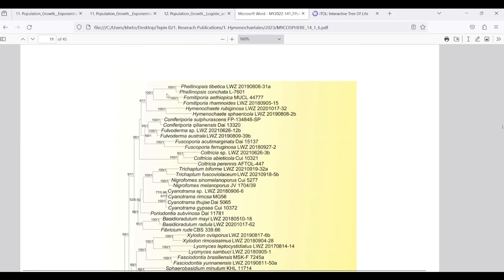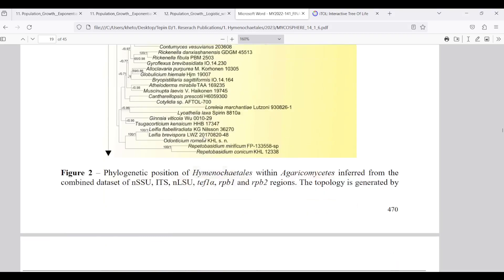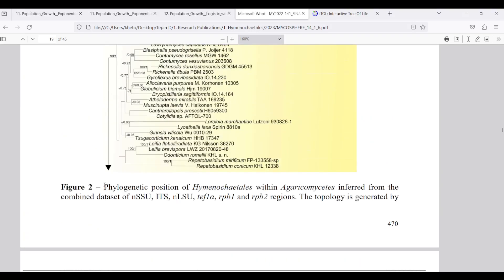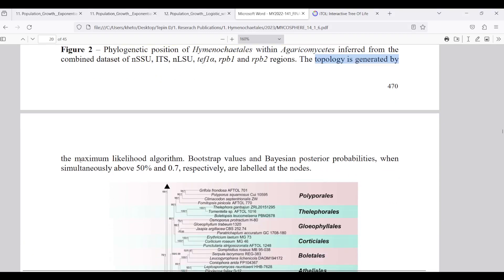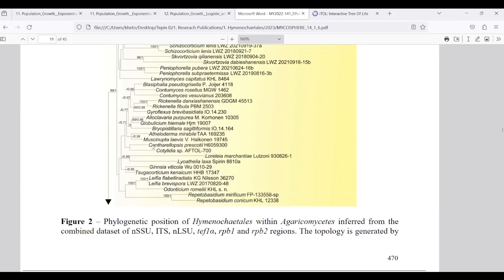In this tree you can see two types of values — for example, 100/1 — indicating different types of analysis. This is a phylogenetic tree generated by maximum likelihood with bootstrap values, and Bayesian inference for posterior probabilities. Bootstrap values are usually done in maximum likelihood analysis, whereas posterior probabilities are generated using Bayesian inference analysis.